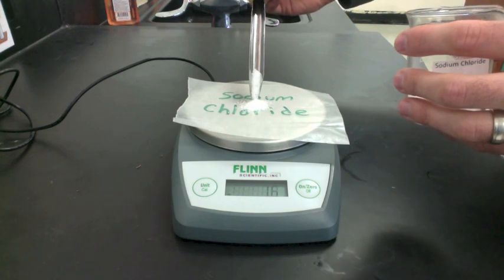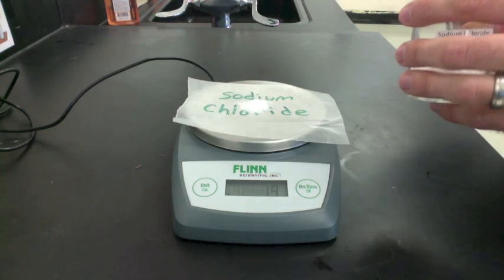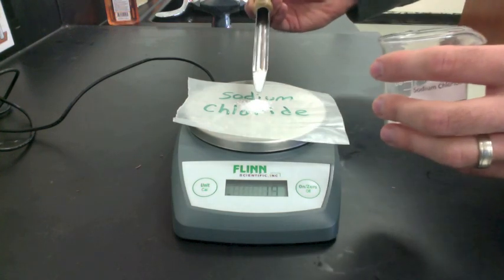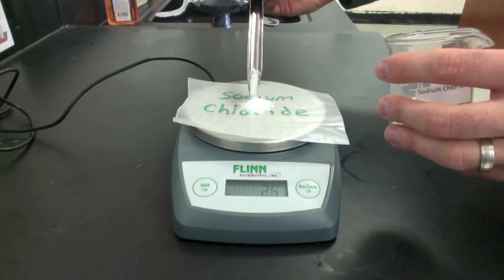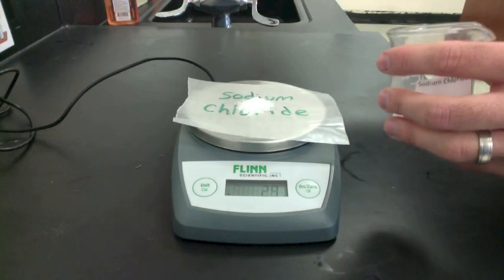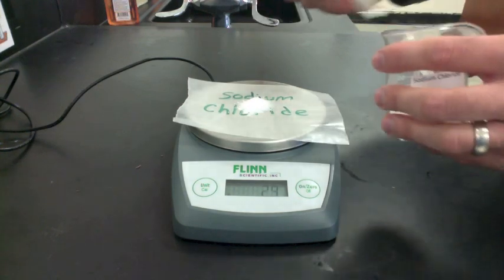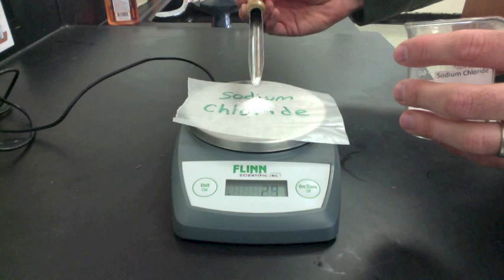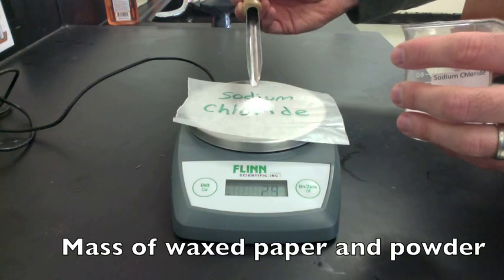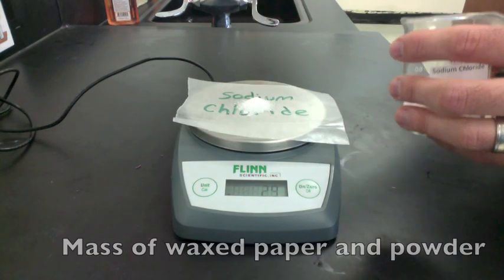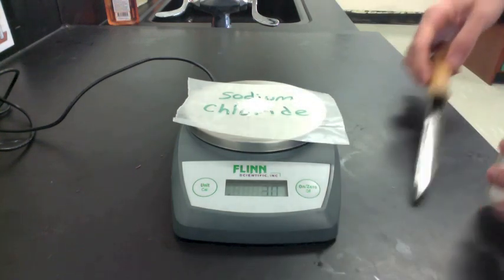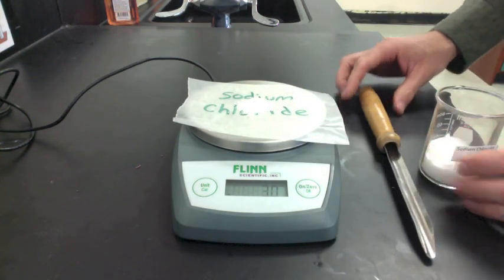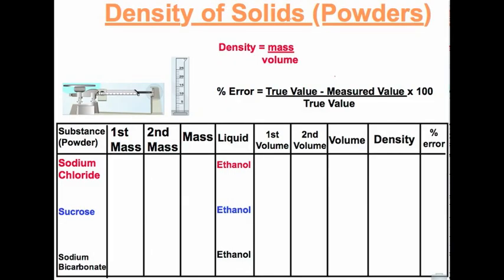We can then put the powder, the sodium chloride, on the wax paper, and find the new mass. The combined mass of the wax paper and the sodium chloride is 3.0 grams. We can put these values onto our data table.